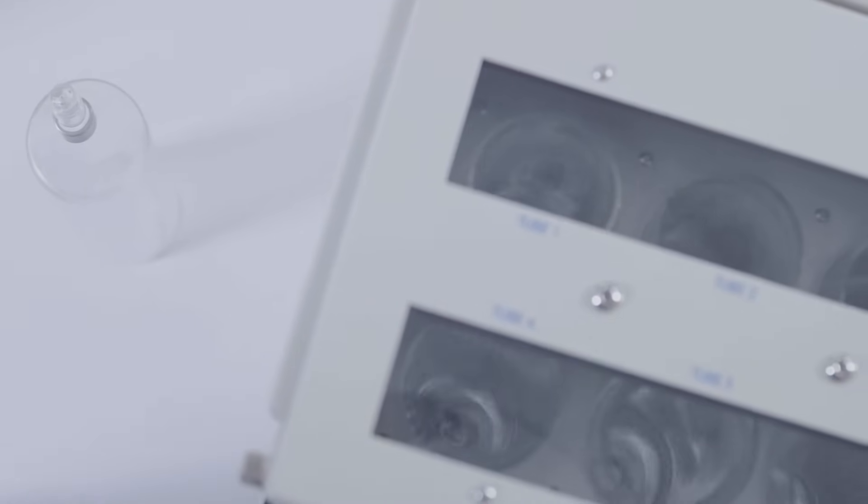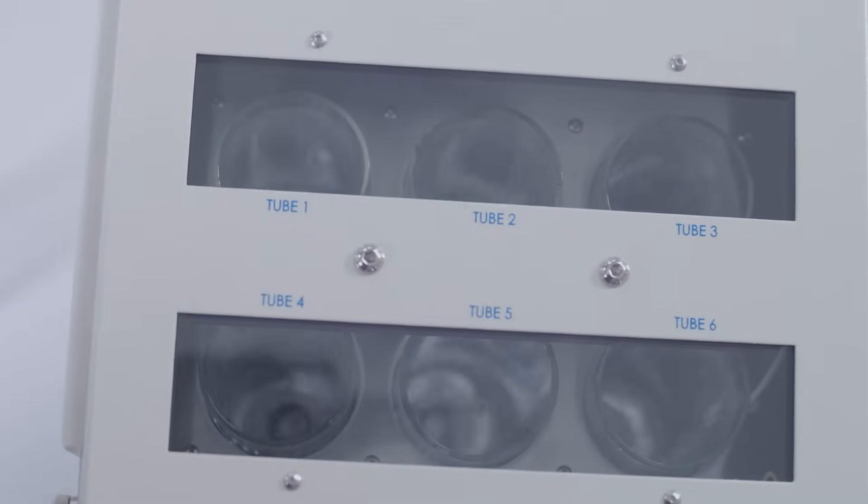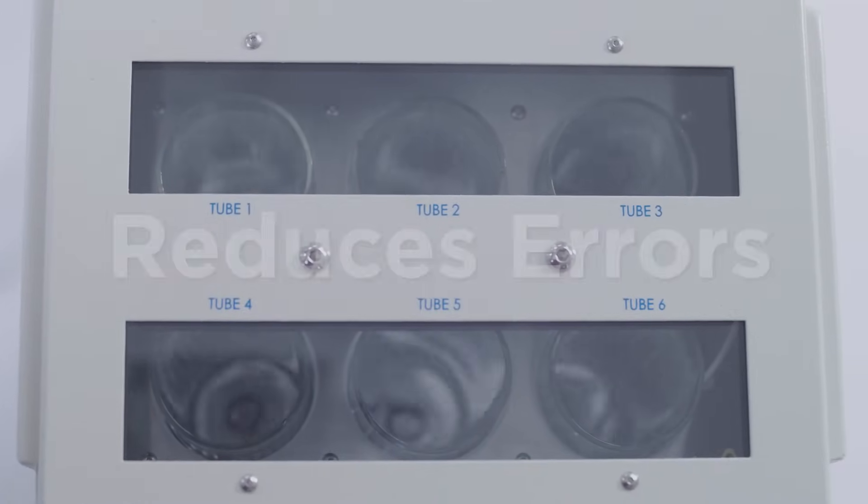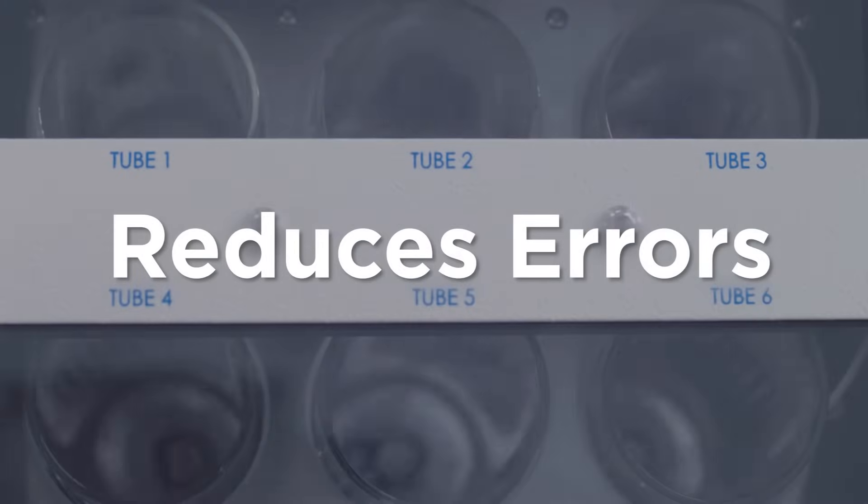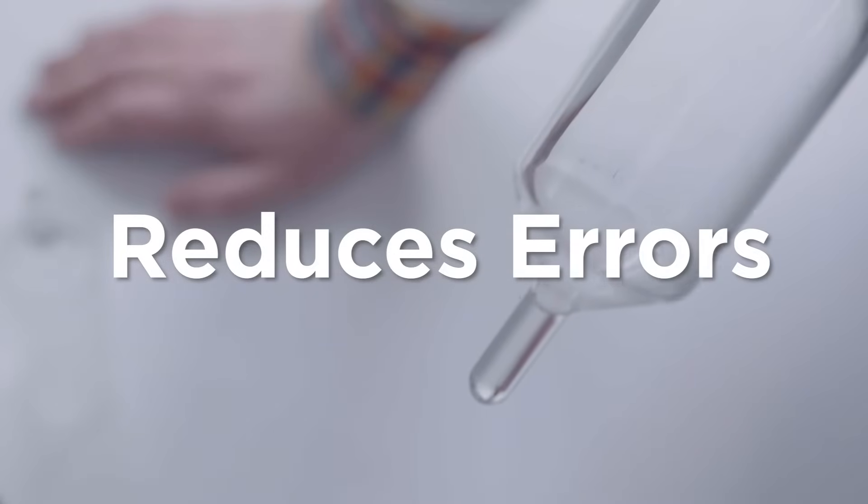Performs the entire evaporation and concentration automatically, achieving consistent, reproducible high recoveries for all analytes. Unattended operation of the process saves labor and time, reducing glassware and solvents.